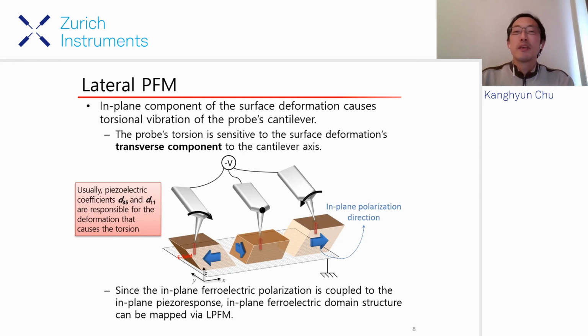But this time there is one limitation. When the in-plane motion is induced, to get that information, we utilize the torsional vibration mode of the cantilever.